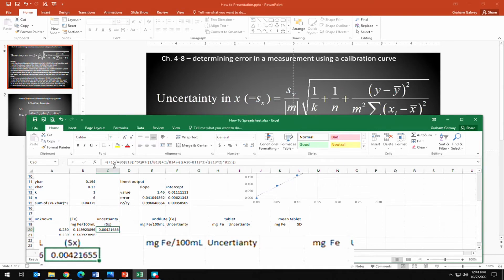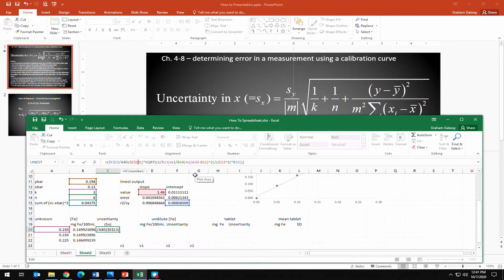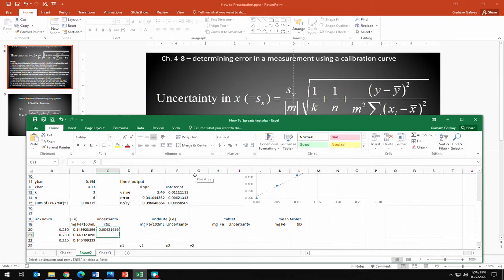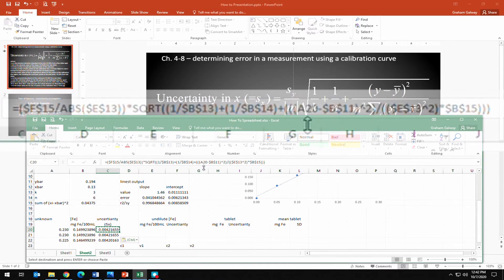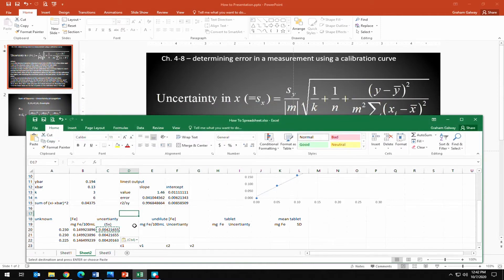Coming back into the formula, we add absolute cell references to everything except the unknown y value — that's the one cell we want to change when copying down. With those dollar signs in place, we copy and paste the S_x calculation for all three unknowns. Arrowing down shows that only the unknown y value changes across the three rows, confirming the formula is set up correctly.